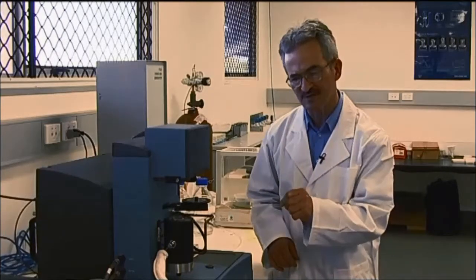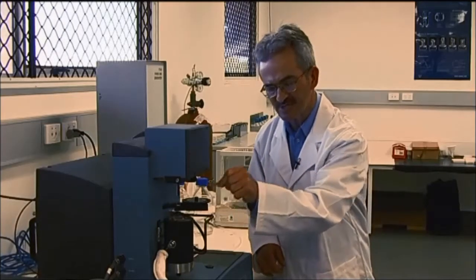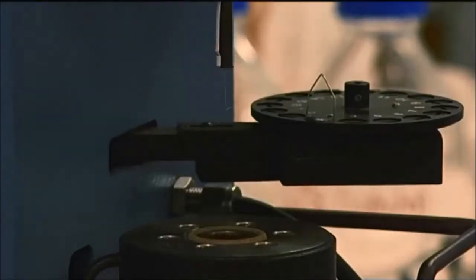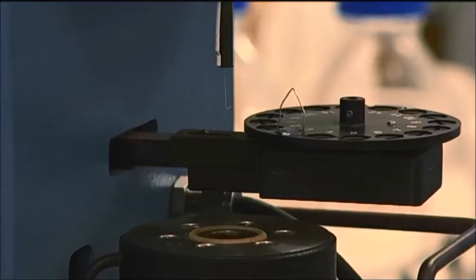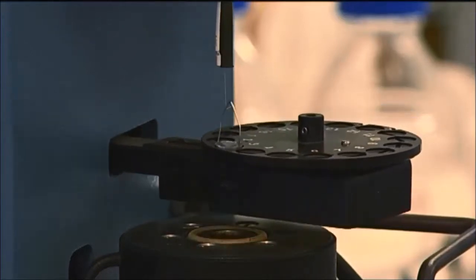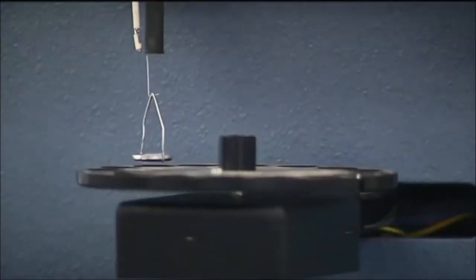We put a small sample between 20 to 30 milligrams inside the crucible. We load the sample inside the crucible and then load the crucible into the furnace of the TGA instrument.